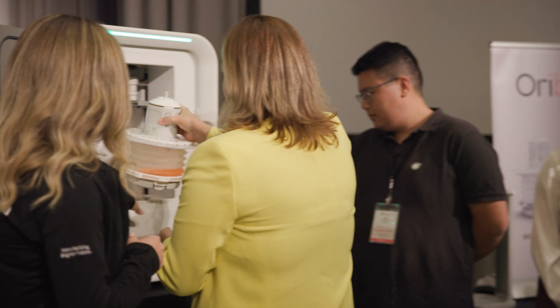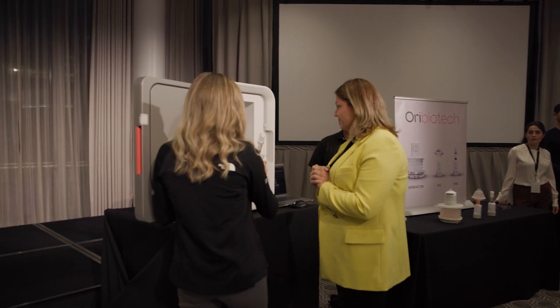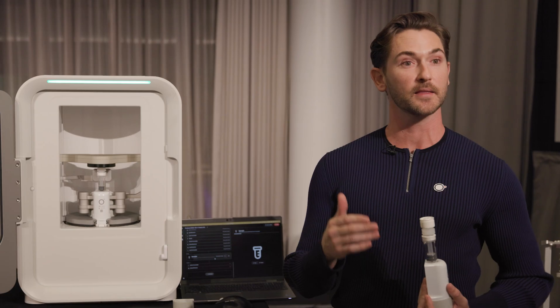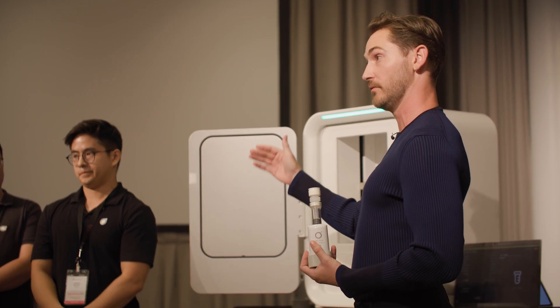The first thing we're going to do today is load a bioreactor. This is what you would do at the start of each culture. The flexibility here really ensures that you can achieve superior cell growth. To load, you're simply going to slide it on the base here. We've characterized the appropriate mixing that needs to occur at every single volume range to ensure that you're getting a homogenous mix at every single culture volume.